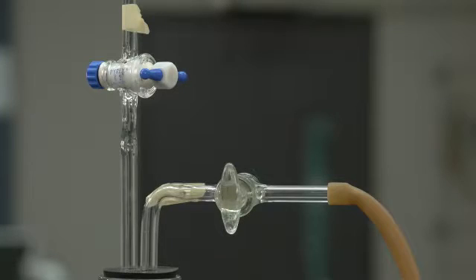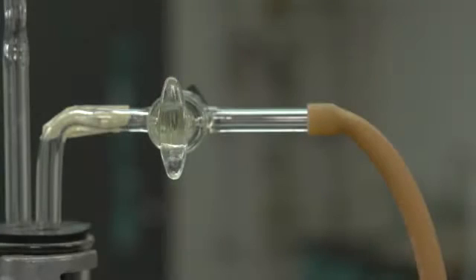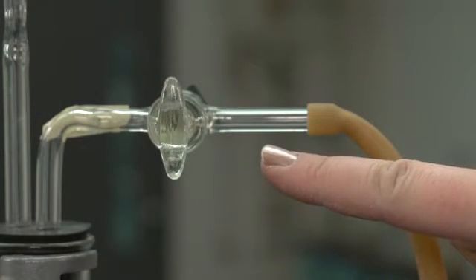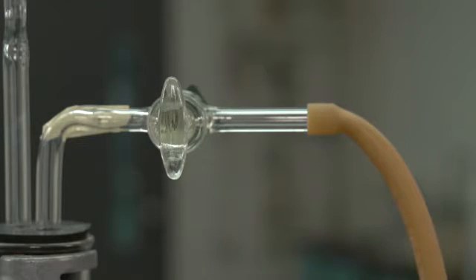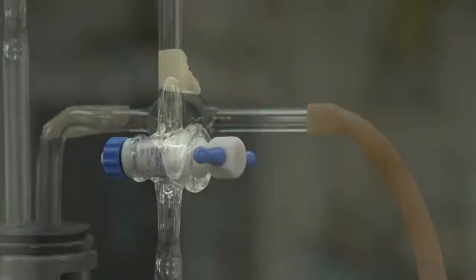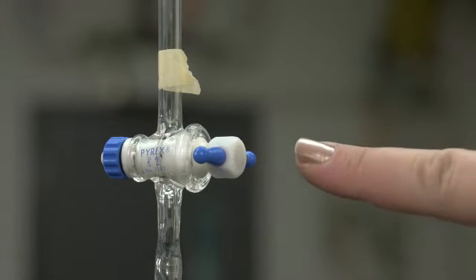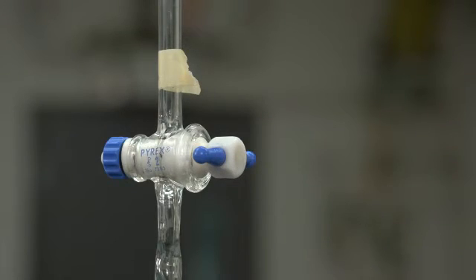The effusion apparatus has two stopcocks. The first stopcock allows gas from the source to flow into the apparatus and prevents gas from escaping through the fill tube during a run. The second stopcock opens the apparatus to the small hole that the gas will escape through.